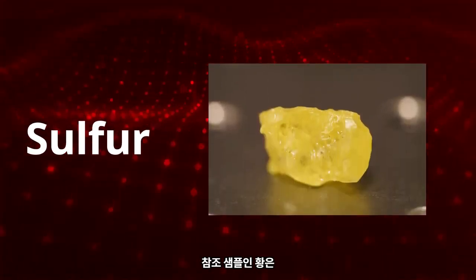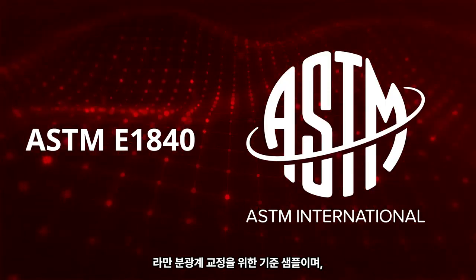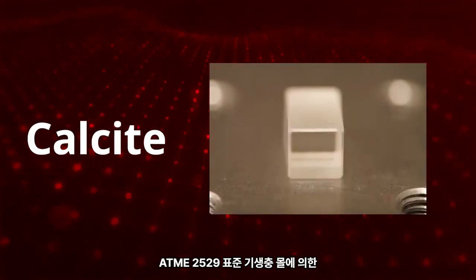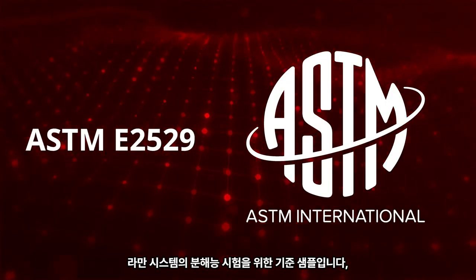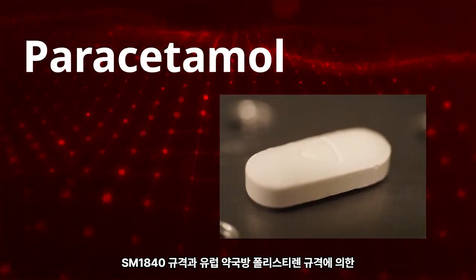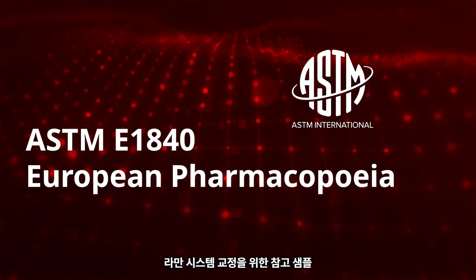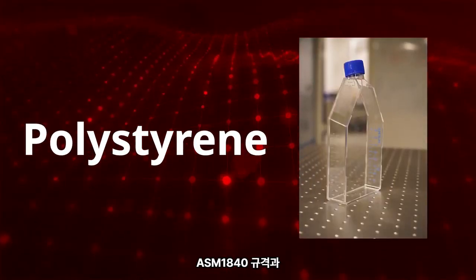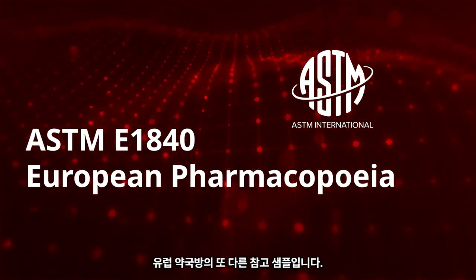Sulfur, a reference sample for Raman spectrometer's calibration in low-frequency range according to the ASTM E1840 standard. Calcite, a reference sample for testing the resolution of Raman systems according to the ASTM E2529 standard. Paracetamol, a reference sample for calibration of Raman systems according to the ASTM E1840 standard, as well as according to European Pharmacopoeia. Polystyrene, another reference sample again from the ASTM E1840 standard and from the European Pharmacopoeia.